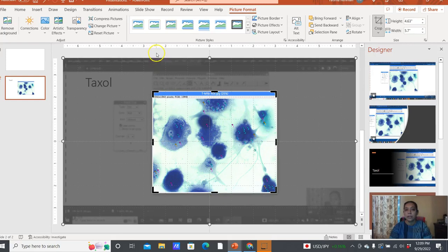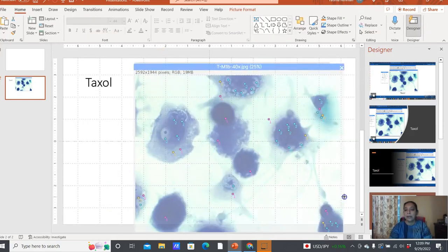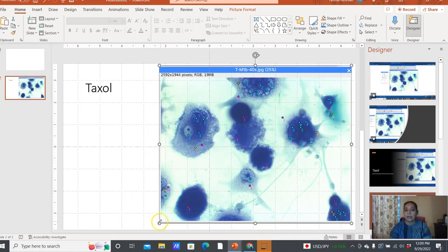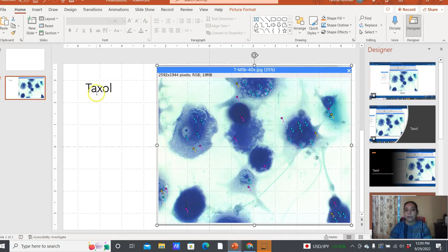And that's going to give me a screenshot of what you counted, right? And how you observed these cells. And it's going to allow me to figure out if you were making a mistake or if everything was being looked at correctly. So I do want you to give me a slide like this for each one of your samples. So you'll just have one image, right? And the final, for the remote students, obviously, are looking at all your images like that.